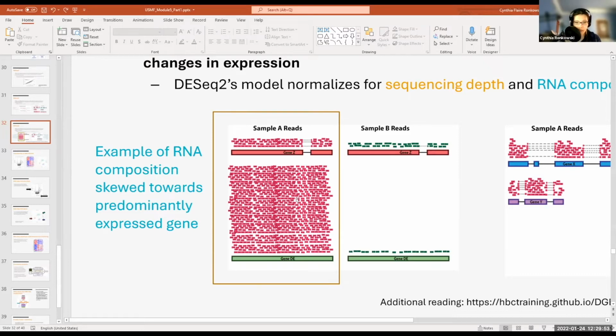Let me come back to this data frame, the count gene matrix. For each gene, for example in sample 1, for the first gene we have 723. So this is the sequencing depth of this gene.